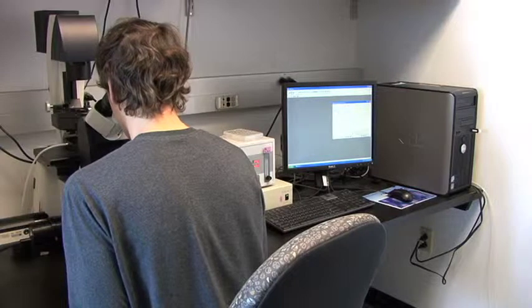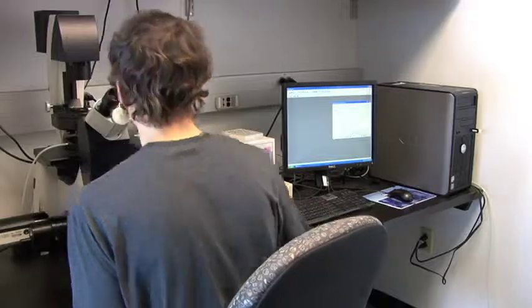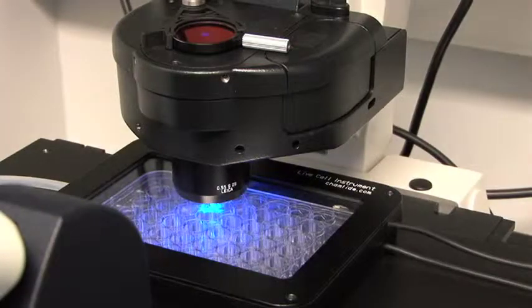What I want to do is find the cells, get them in focus. Once I have a good position, I will set it on the computer. The images are compiled to create the video of the cell's movement.